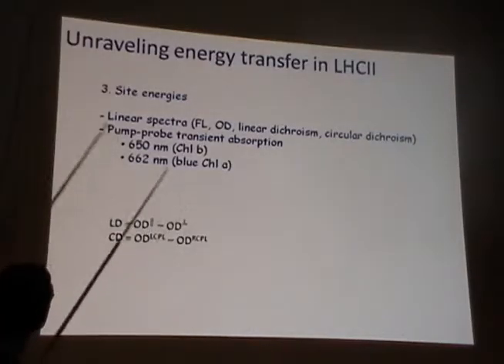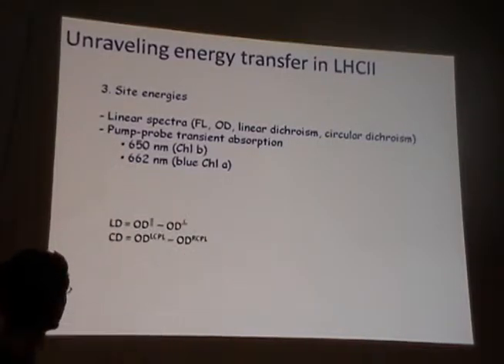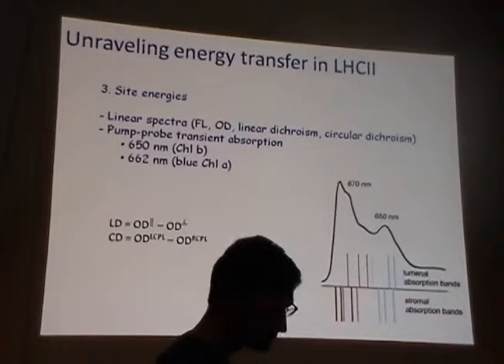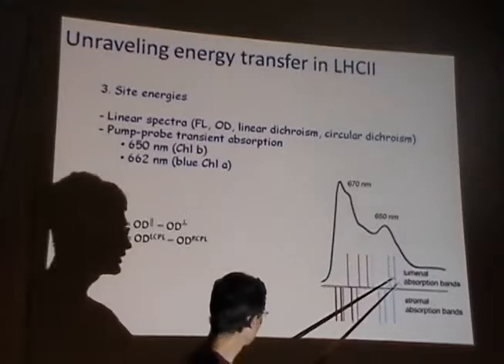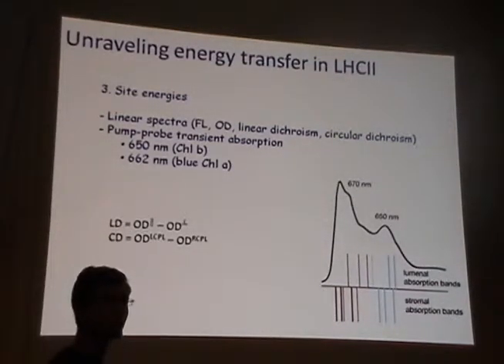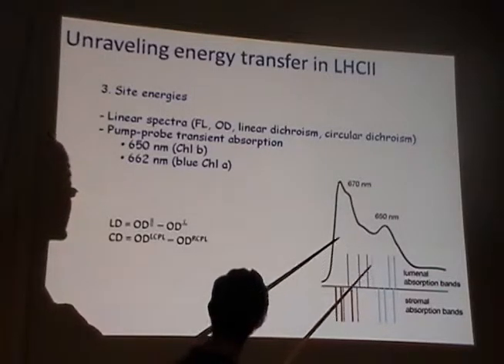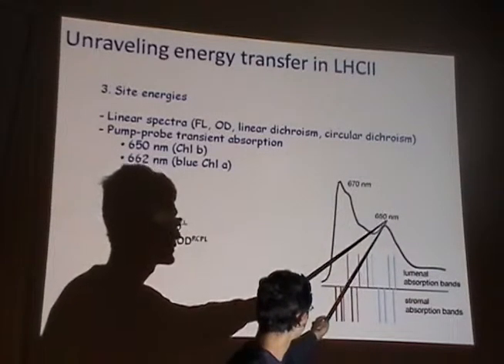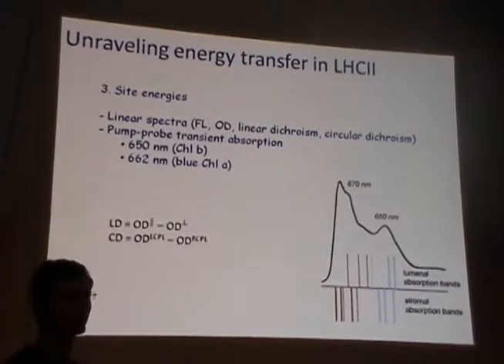In this talk I want to elaborate more on pump-probe spectroscopy. These are techniques in which you can get a significant amount of information from these light harvesting systems. But in order to get information about site energies, two different excitation wavelengths are used for the pump beam. Looking at the absorption spectrum of LHC2, here are all the different site energies corresponding to 14 chlorophylls in one monomeric subunit of the trimer.